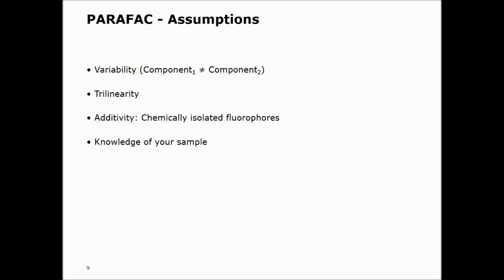Just for full disclosure, PARAFAC makes a number of assumptions which you need to know in order to know whether or not you can use PARAFAC to mathematically decompose your EEMs. First of all, we have a variability assumption. That basically says that two fluorophores can never occur in the same exact concentrations with the same exact emission and excitation properties.